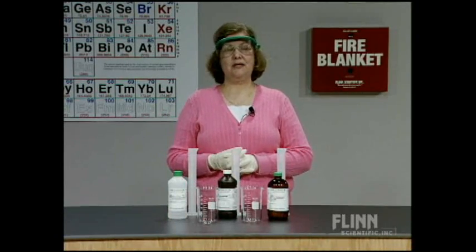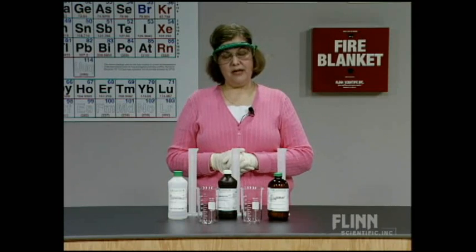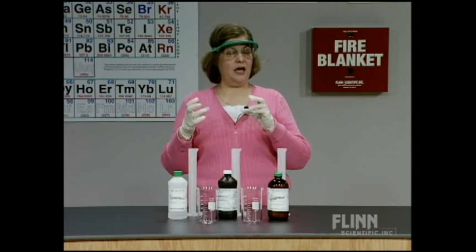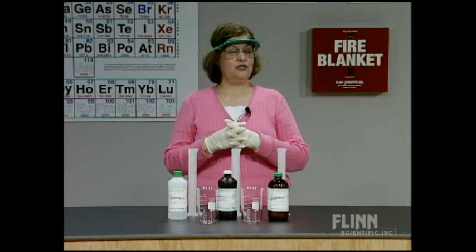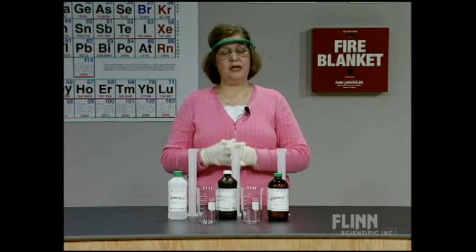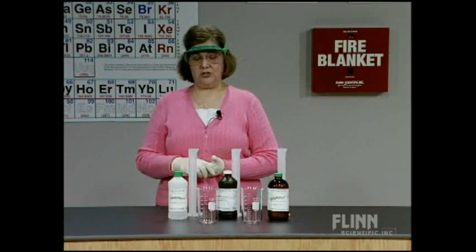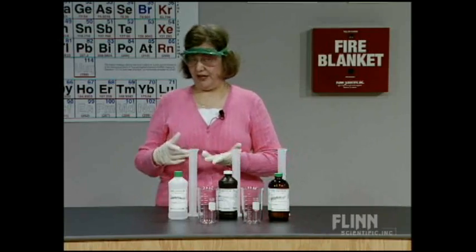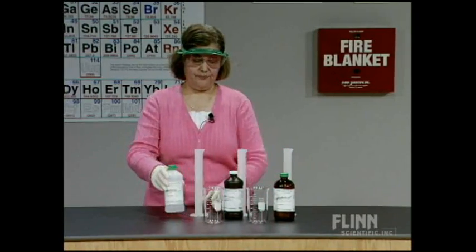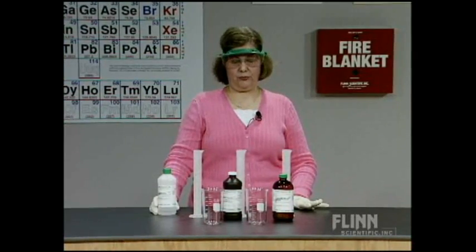Well, it's not because it's an easy topic, because it's not an easy topic to explain. But I think it comes at a good point, and it allows you to see some unique chemistry, some chemistry that is hard to explain, but really focuses your attention on some concepts that otherwise you couldn't teach. And that's one of the things that makes a good demonstration as well, because it's effective then, in addition to being fun. This one is called Yellow-Blue Switcheroo. It's an example of an oscillating chemical reaction.